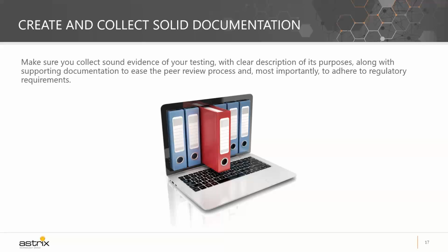Another document that is very helpful when leveraging Empower calculations is a calculation design specification. You have to think that not everybody knows how to create customized calculations within Empower. There's a learning curve to that, but you have to at least let people know what a formula is supposed to do. A calculation design specification is a sound document that shows people what a determined formula is designed to do and what outcomes come from that formula. Even if a person does not know how to create custom fields themselves, or cannot read the formula written in the documentation, they know what to expect from that formula, and they know what needs to be checked to see whether the formula does that or not. It helps reviewers understand what customized formulas are developed for and what their expected outcomes are.